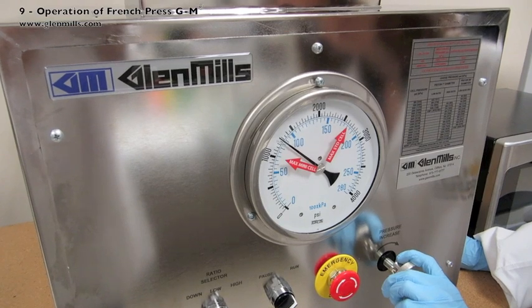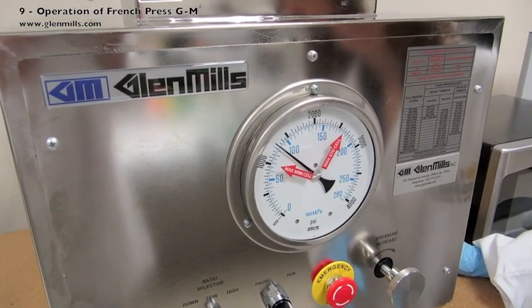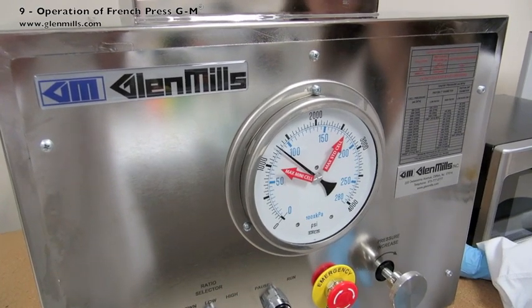Once the target pressure is reached, or held at pressure for a few seconds or minutes depending on the protocol, the samples can be released from the standard pressure cell.